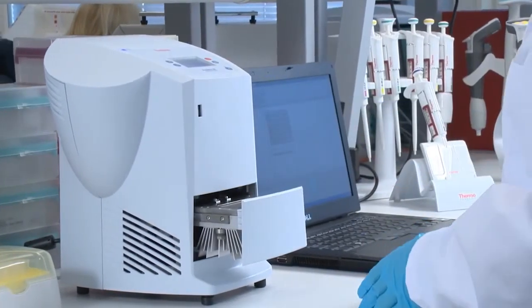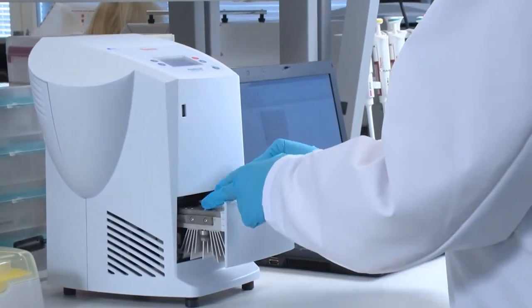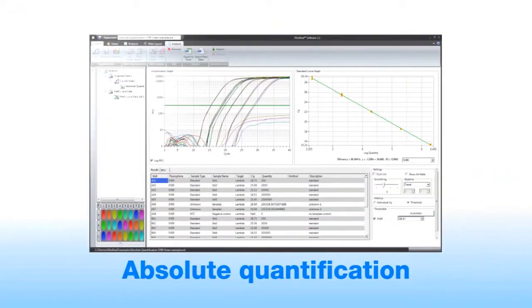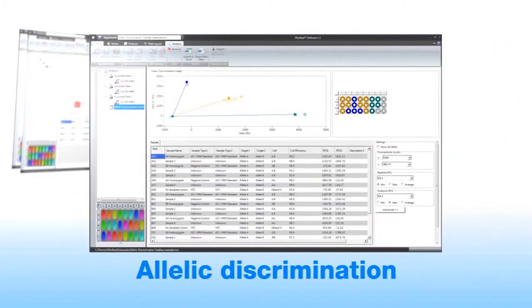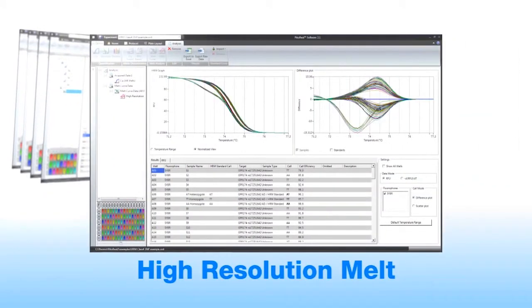ThermoScientific PicoReal real-time PCR system is controlled with the PicoReal software. The PicoReal software has analysis modes for absolute quantification, relative quantification, allelic discrimination, melt curve, and high-resolution melt analysis.